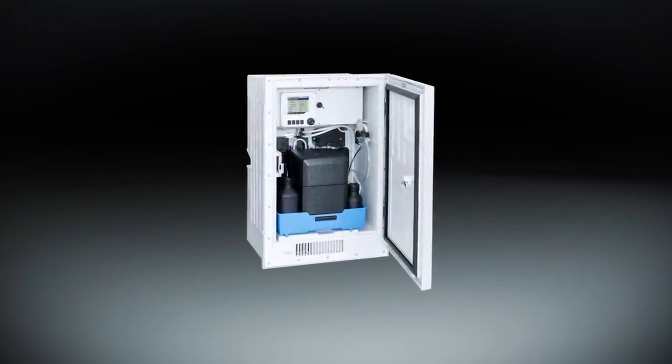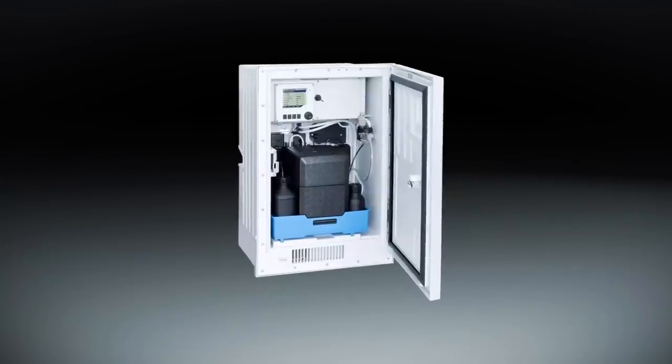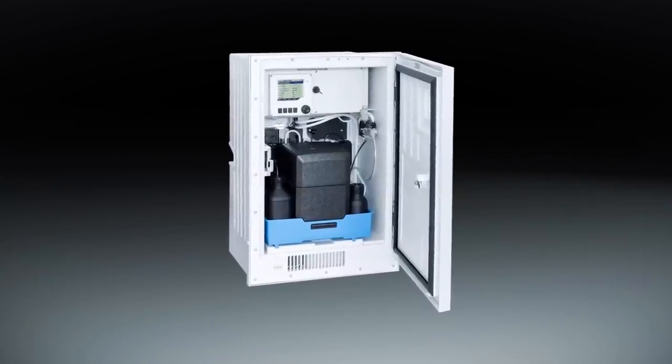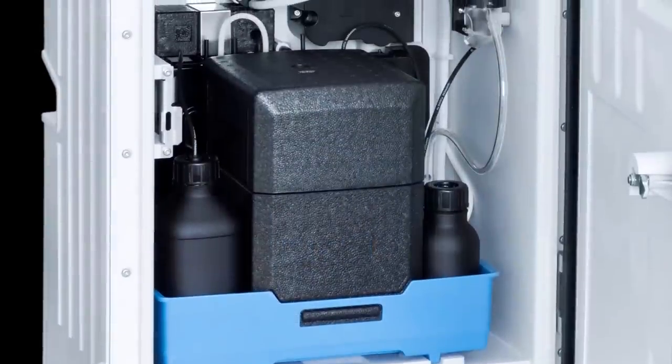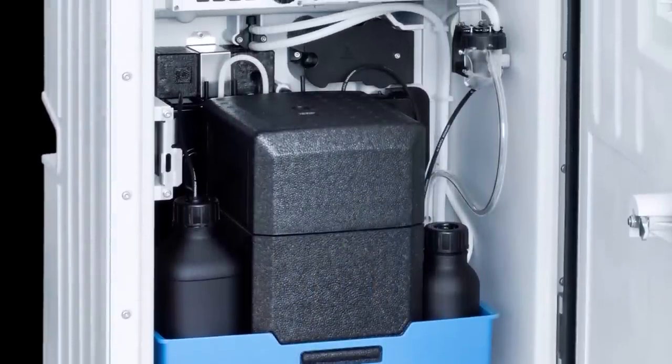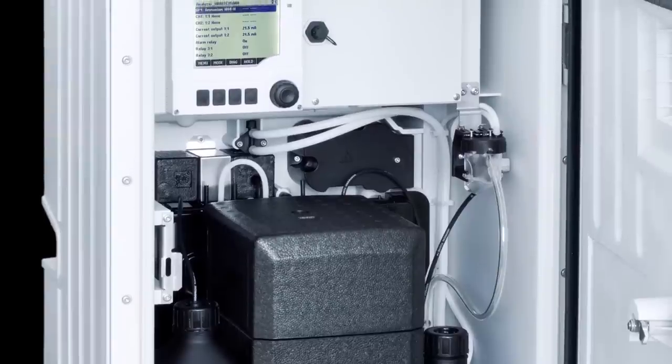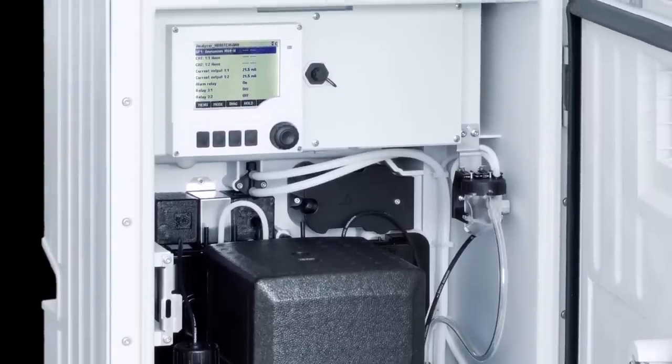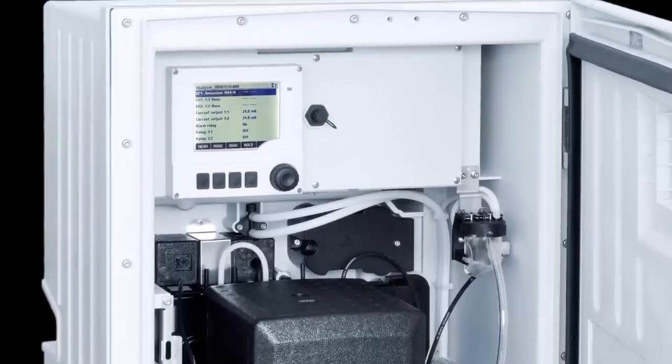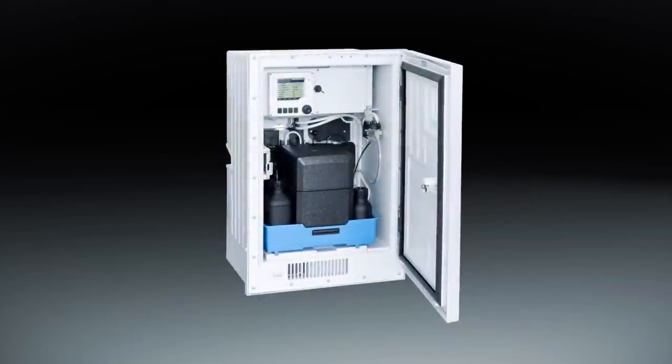Automatic colorimetric analysis is performed by compact systems, such as Endress+Hauser's Liquiline System CA80. Such systems consist of various components for sampling, sample treatment, and the colorimetric analysis of the sample, and enable reliable analysis of a wide variety of parameters.